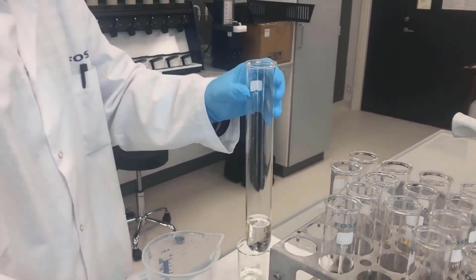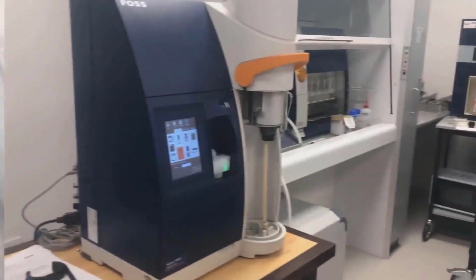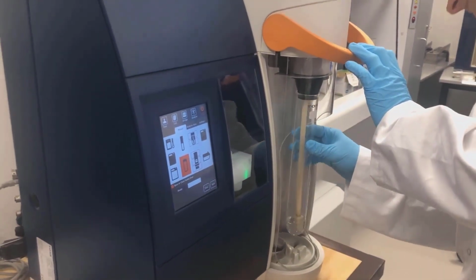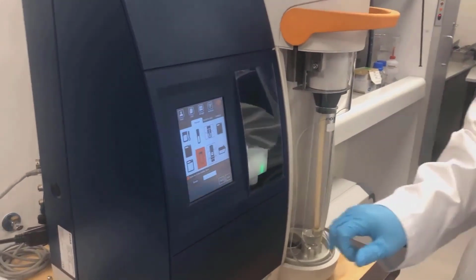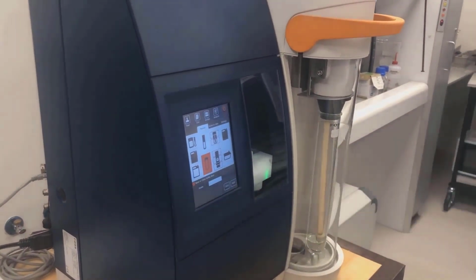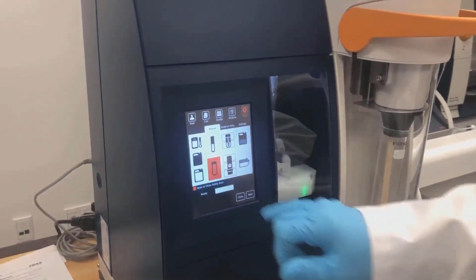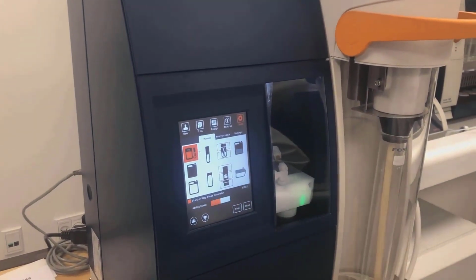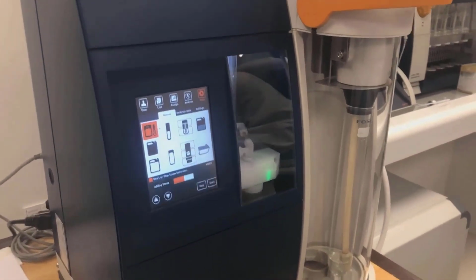Next step is to load this tube into the Kjeltec. Now we load the tube, close the safety door, and add the steam. It will take 5 to 10 minutes.